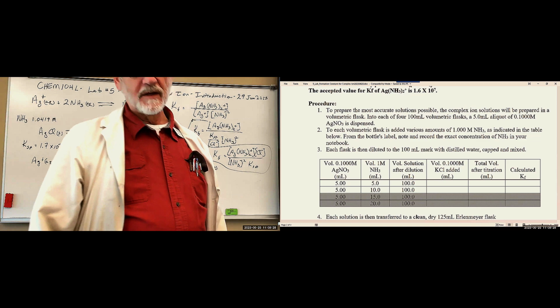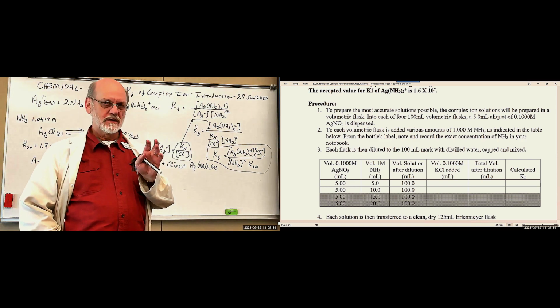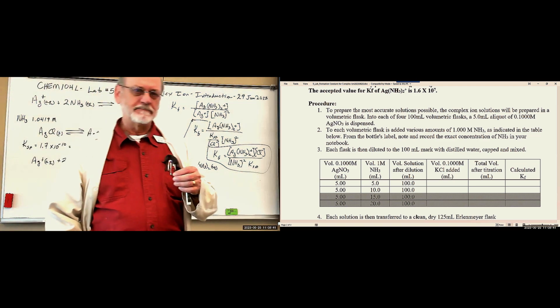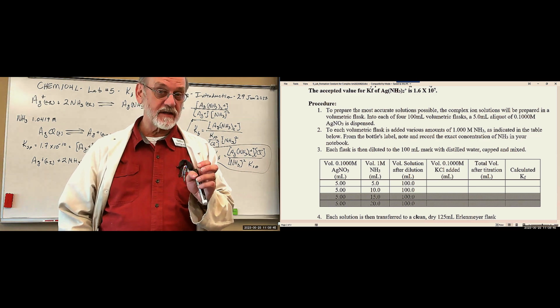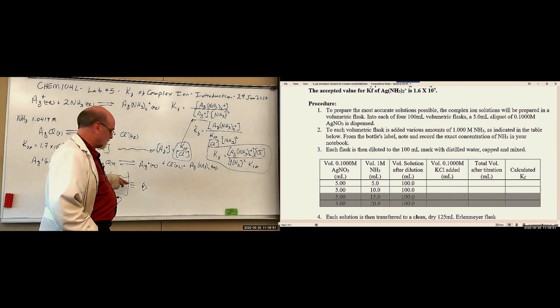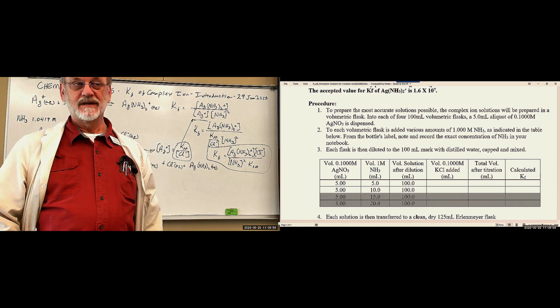But I ran the first one, the second again, because I wanted to be sure of the procedure with the reagents that I have currently, because I had to remake one of them. And I found that the volume of 0.1 molar potassium chloride that I needed to reach that precipitate was a little over 1 milliliter.